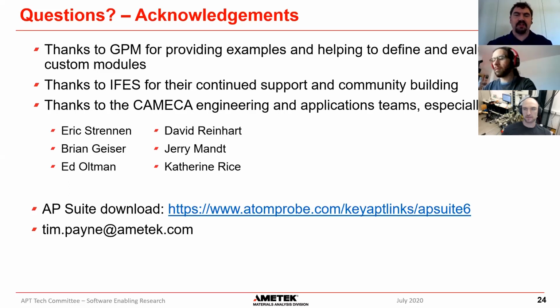That's an excellent question. Our new software has an export function, which will export all the data from experiment through reconstruction to analysis, and creates a package of your RHIT file. Now we have a file format called hits for the raw format, which is actually a closed format.